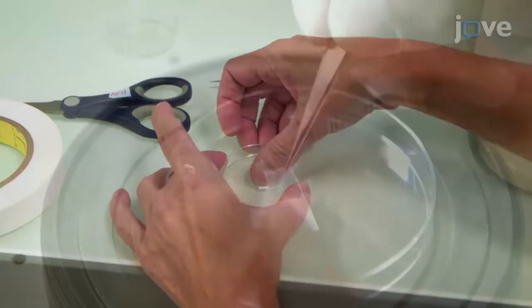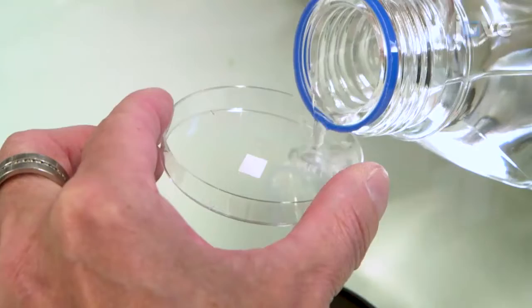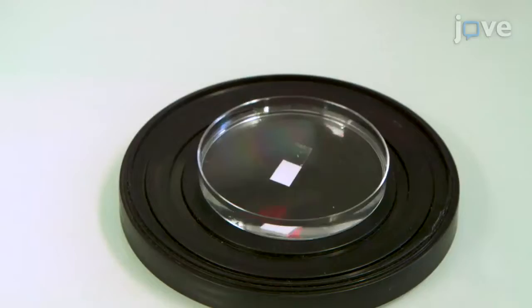To begin, place a piece of double-sided tape into the center of a 5 cm diameter petri dish. Add a sample of gynoecium that has been isolated from a flower bud to the tape. Rapidly add water to the dish until the sample is completely covered so as to avoid dehydration.